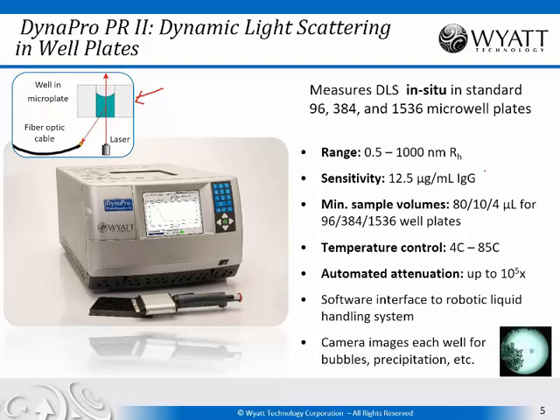The sensitivity of dynamic light scattering in general depends on the molar mass of the sample. So if you have a smaller protein, for instance, lysozyme, which has a molar mass which is 10 times lower than that of IgG, its sensitivity will be 10 times lower, meaning 125 micrograms per milliliter. On the other hand, if you're measuring larger particles like liposomes, the sensitivity will be very, very high, and you really don't need to have too many in solution to get good measurements. The minimum sample volumes are stated here as well, and so if you're using the 1536 well plate, you can use as little as 4 microliters of sample at the concentrations mentioned here.